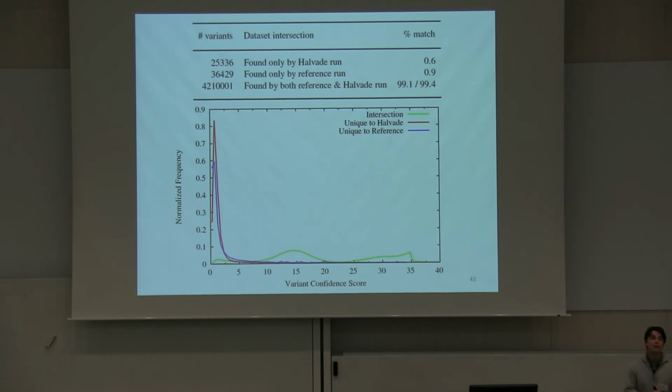Well, it turns out that the majority of the variation comes from the fact that instead of running one instance of BWA over the entire FastQ file, we are running several instances in parallel over a chunk of the FastQ file. BWA is not provided with the insert length. It learns this from the input file itself by mapping a number of reads. Well, if you train BWA on the entire FastQ file, it gets a slightly different insert size than training BWA from, let's say, a middle chunk somewhere.